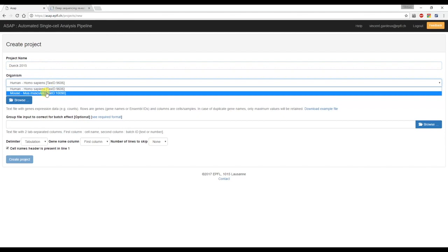It's not mandatory, but if it's present in the list, then it's always better to have it for helping the enrichment. These organisms are based on the Ensembl database. So there are 69 species from the full Ensembl database since release 47, I think.